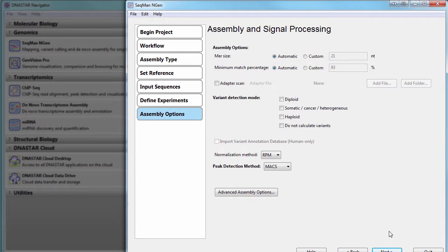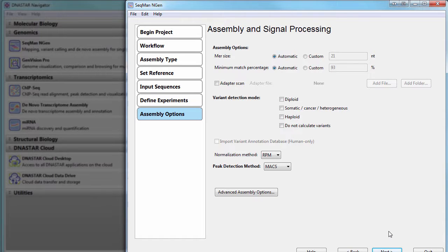Now, on the Assembly Options page, we can specify the parameters for Variant Detection, Normalization, and Peak Detection.